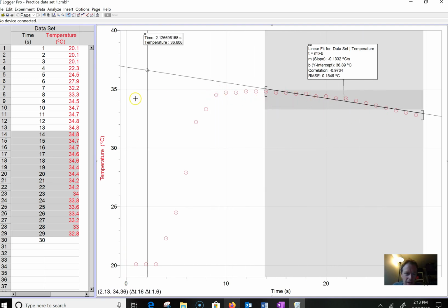What I want to do is I don't want to go all the way back to before, like time -1 or whatever. That wouldn't make sense. I want to go right to when I actually initiated the experiment. And if you look at the write-up that we'll go back to in a second, it does say they waited a few seconds before they actually put the zinc in. So the reaction appears to have started about right here, because then I see this big jump.